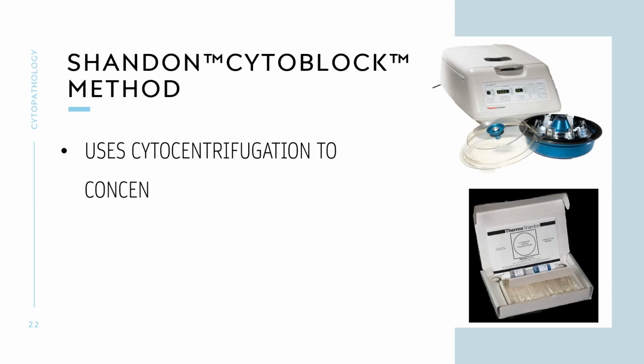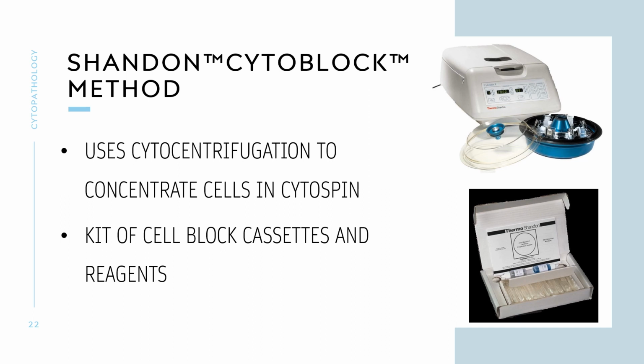We have the Shandon Cytoblock method. It uses cytocentrifugation to concentrate the cells in the cytospin. There are already available kits of cell block cassettes and reagents.